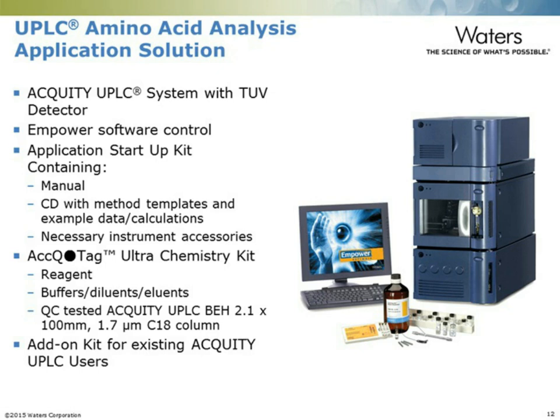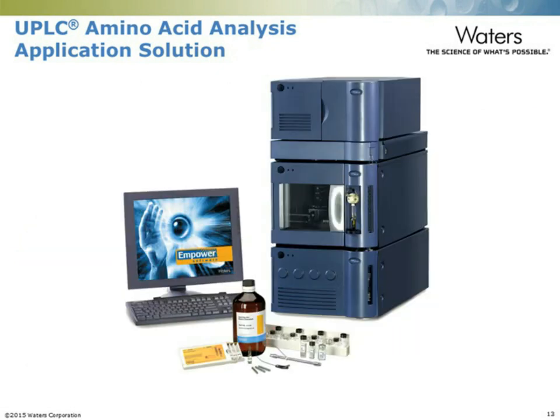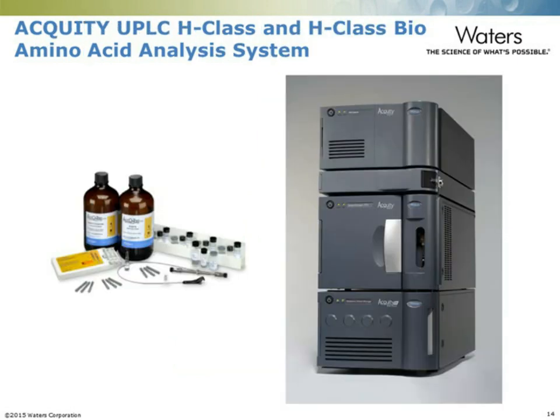It can be used with the ACQUITY H-class and the ACQUITY UPLC. The method was originally developed with the UPLC and was then extended for use with the H-class and the H-class Bio systems. The two methods use the same chemistry kit and follow the same protocols.